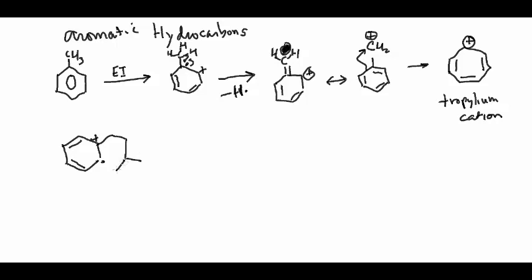Now, in the McLafferty rearrangement, there is the equivalent of a double bond that would actually be over here, and the carbon attached to that, or atom I should say, because it can be carbon, nitrogen, or oxygen, is the alpha atom, and this is the beta, and then this atom is the gamma. So the hydrogen here, in fact, is referred to as the gamma hydrogen.